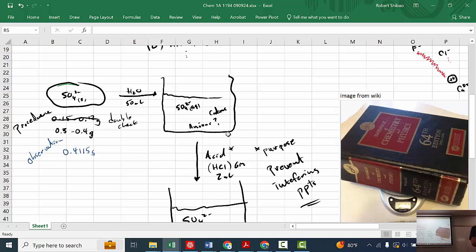But anyway, this is probably going to be too hot to touch. You can use paper towel to grab it if you need. But these are beaker tongs. Beaker tongs, and what are the other tongs you have? Crucible tongs. This. So I set everything up. This is going to be hot. This is fine. If it's hot, the water is not going to reabsorb.